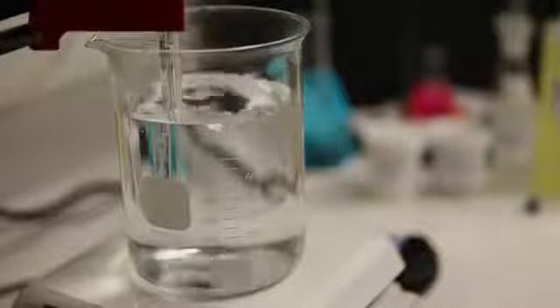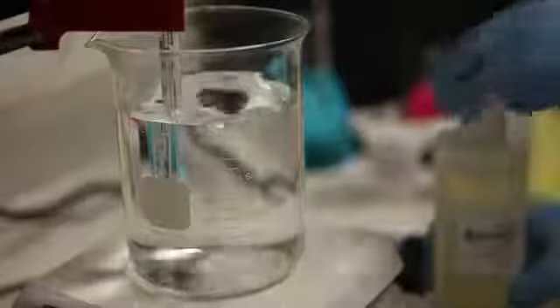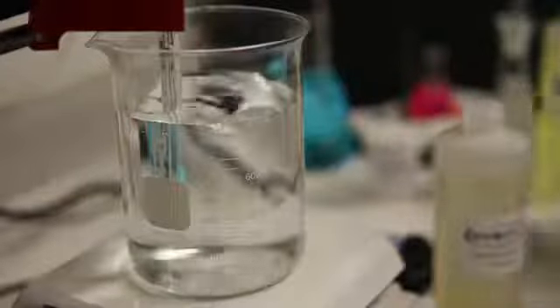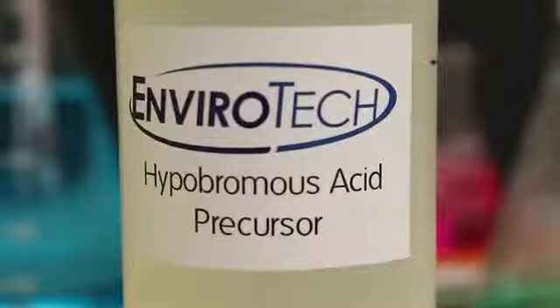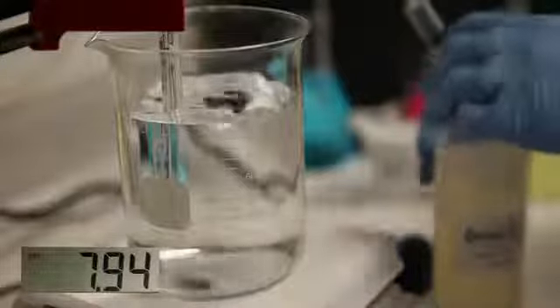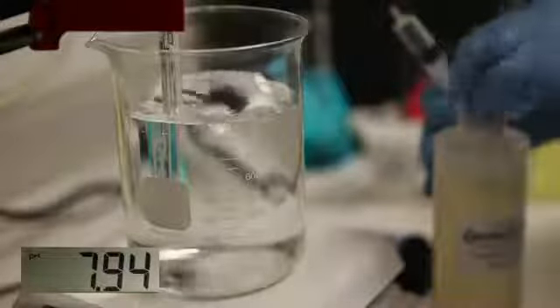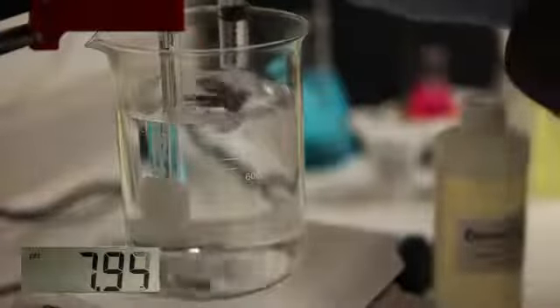The beaker contains 900 ml of ordinary city water. To make a concentrate of 3000 parts per million available bromine requires 4.9 ml of HB2. The procedure is written on a document on the stabilizedbromine.com website, but to see it with your own eyes is a lot more fun. The pH of 7.94 is typical for tap water in this part of the country.